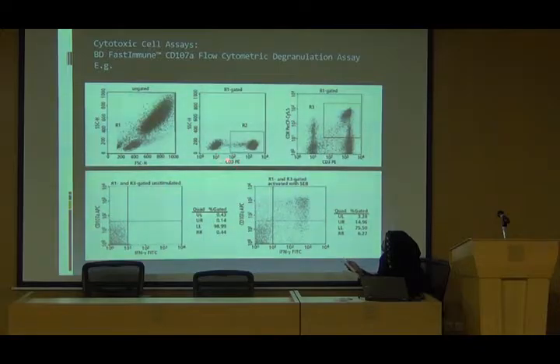And I'm interested in CD3, why? Because I know CD8 is also CD3 positive. So I'm designing a gate around CD3 positive cells, which is usually these cells. From 1 to 2 is negative, in between here it could be low signal, that means low level expression of that specific receptor. So here I want a population that is CD3 positive and also CD8 positive, double positive. So I get them here from region 1, the first one here, lymphocyte.